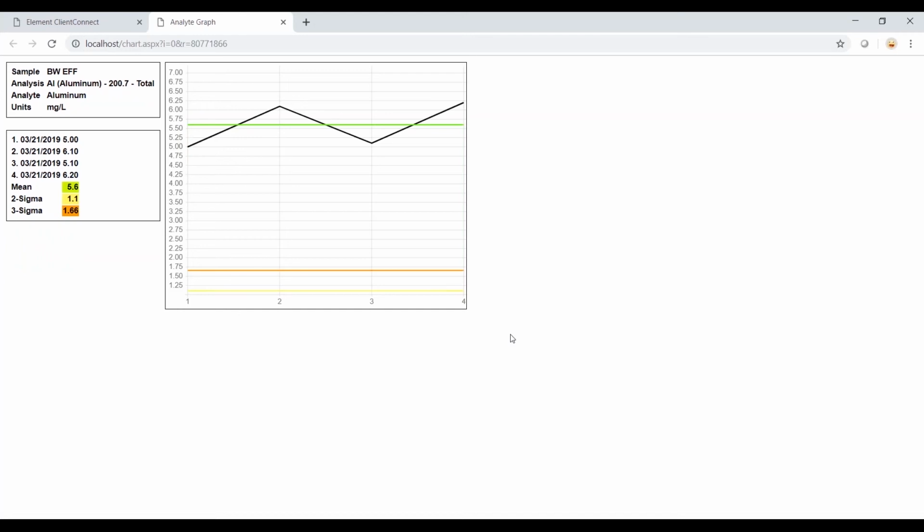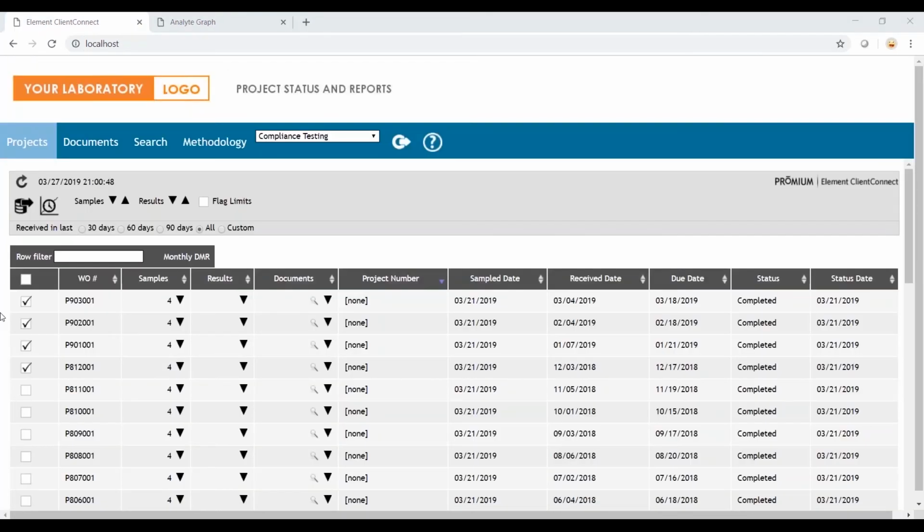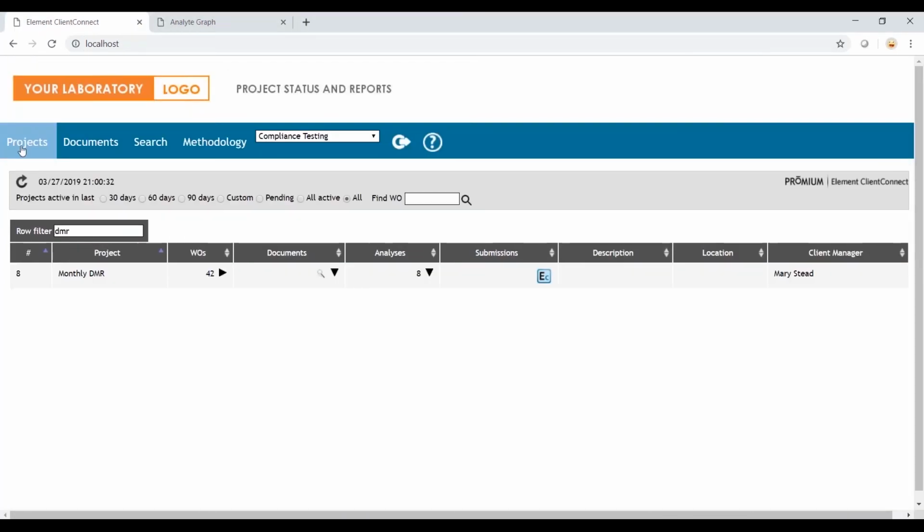Is it what I expect it to look like? We can also start a new submission by clicking the EnviroChain EA button. For more information about submitting a chain of custody using EnviroChain EA, please see our other videos on this topic.